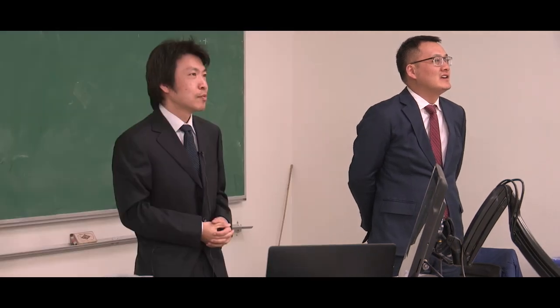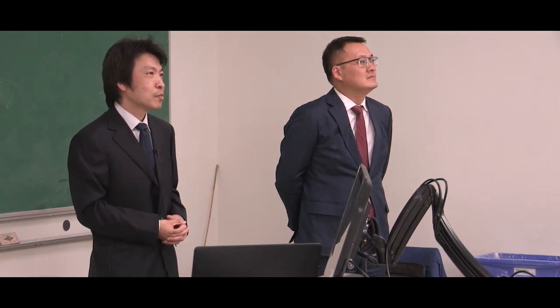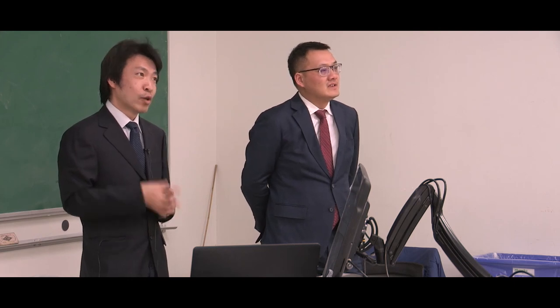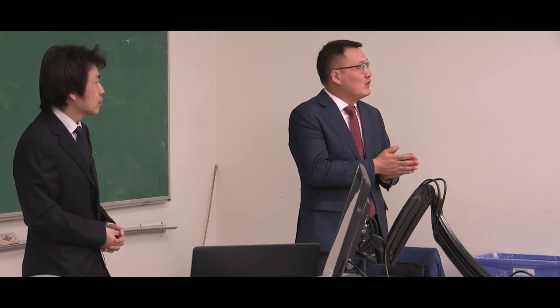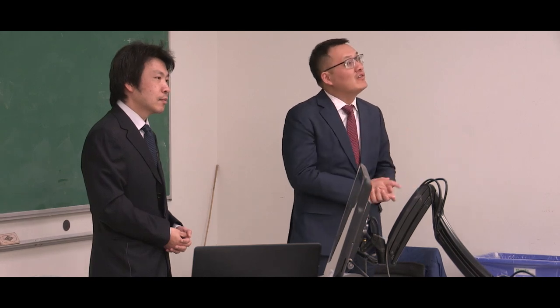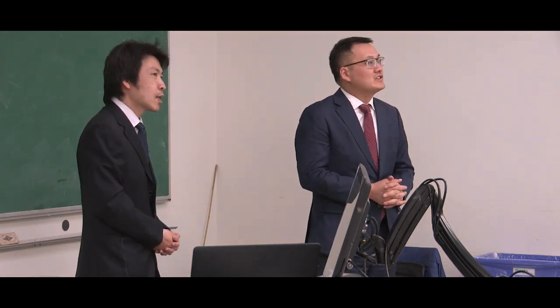Is there cross reactivity, or is it purely sensitive to only one type of mycotoxin, or do we have to be concerned that other mycotoxins would also interact? Right, that's a very good question. We have already been thinking about maybe adding other types of toxins to look at if there are any cross reactions with our device, right? Any noise that will affect our analysis. Yeah, just to add, we also check the pH value. Different pH values also affect the detection result, and also probably the mineral concentration in the solution or in the sample may also affect the detection as well. So we will do that with this test in the future to see how it will affect the result.